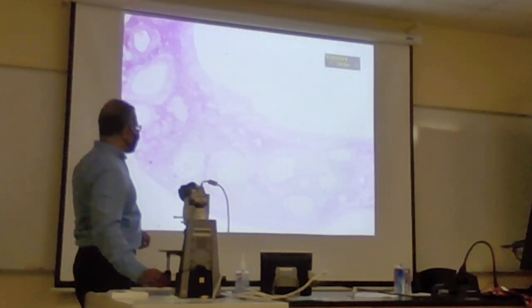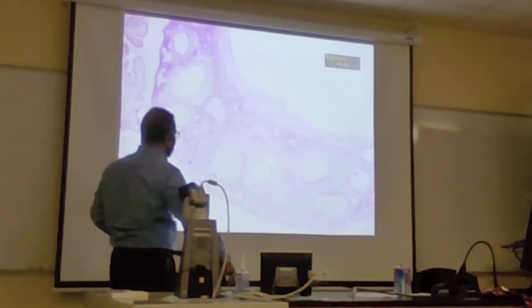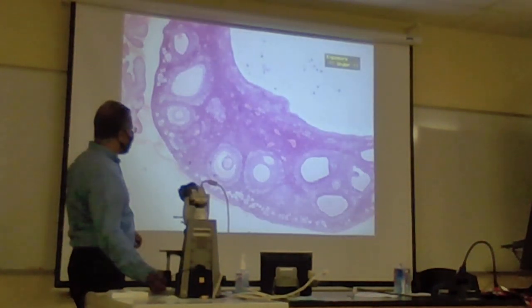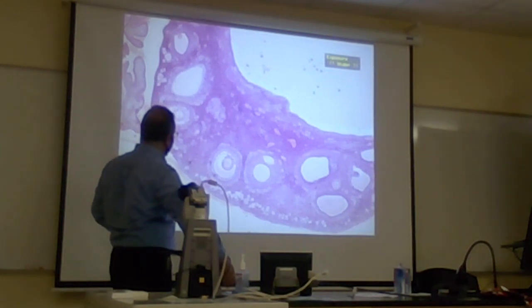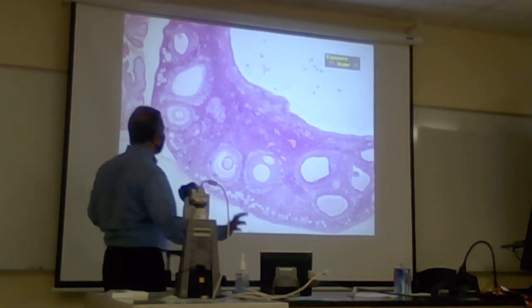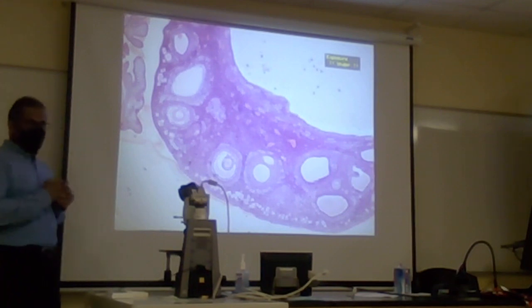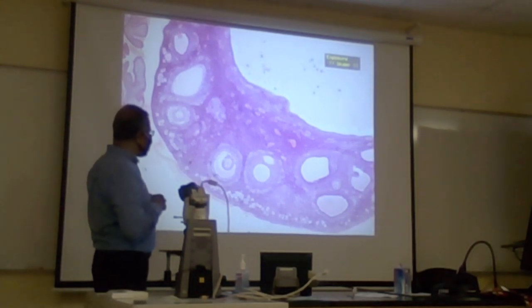So let's look, a little familiar. How about this? So what do you see here? Follicles. How many types of follicles do you see? 1, 2, 3, 4 more.